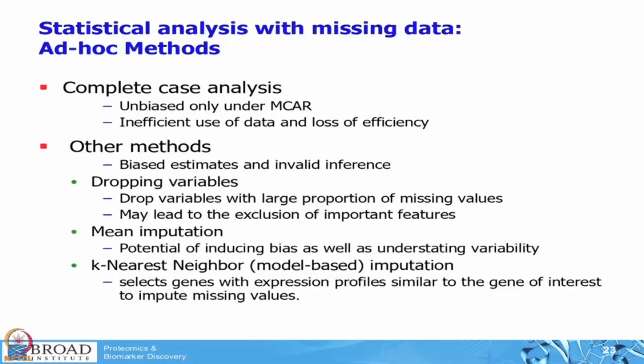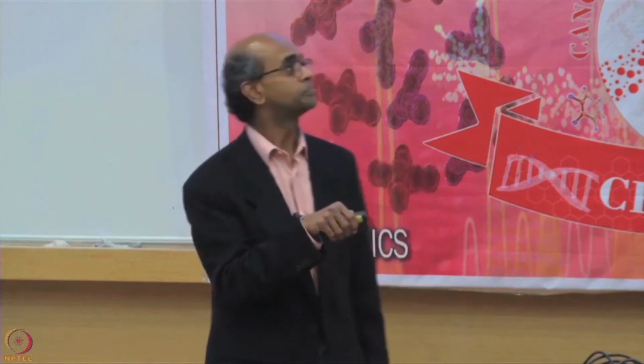So in the analysis we do, we have a relatively high threshold. I think if the data is missing in more than 70% of the samples, then we throw that away. So if a protein has not been observed in 70% or more of the samples, we throw it away. If we start with 12,000 proteins and we apply that filter, about a few hundred, a maximum of 1,000 proteins will get thrown away. So it's about 5 to 10% of proteins generally. If you look at phosphoproteomics, the number is larger, more like 25-30%, but still it's not that big a number, and it's a reasonable thing to do in most situations.